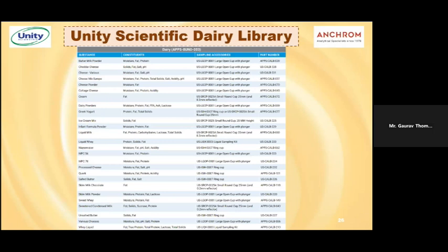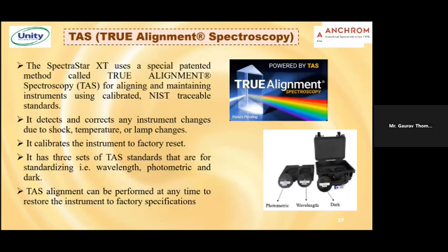So, when you are evaluating all such things, your instrument needs to be calibrated, right? On what basis do you ensure the quality and the authenticity of the results? So, you need some kind of calibration. Yes, we have this poll coming up, which is asking for better butter analysis results. Do you need to follow a tedious calibration process?